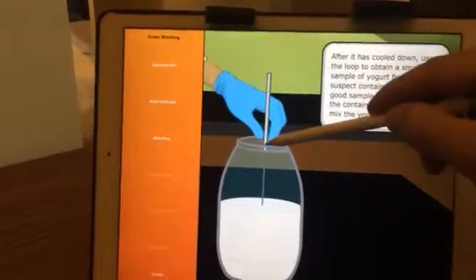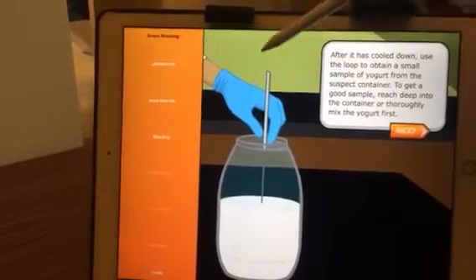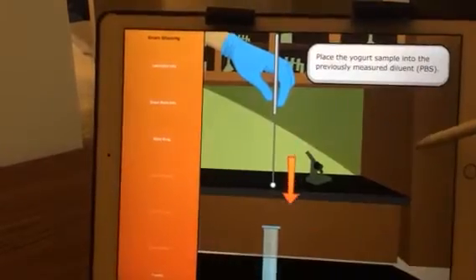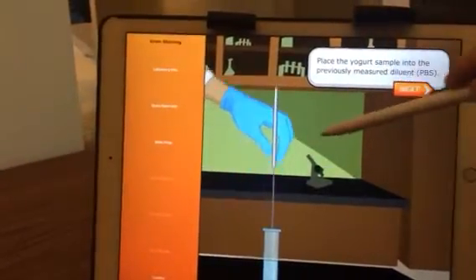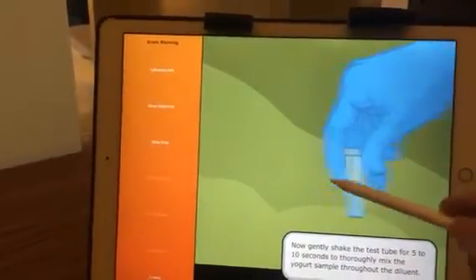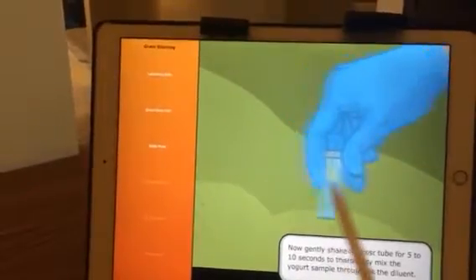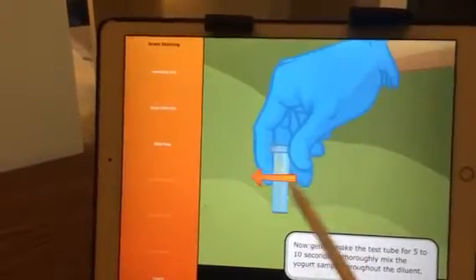After it has cooled down, use the loop to obtain a small sample of yogurt from the suspect. Place the yogurt sample into the previously measured diluent. Now, gently shake the test tube for 5 to 10 seconds to thoroughly mix the yogurt sample throughout the diluent.